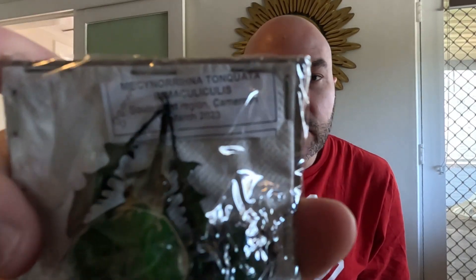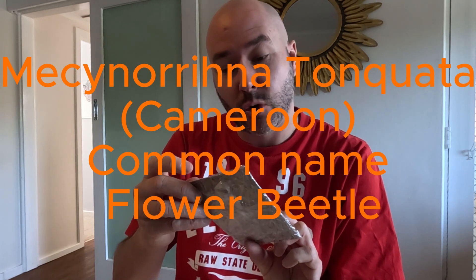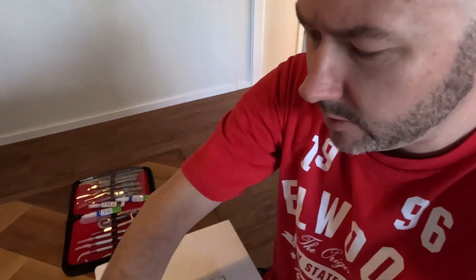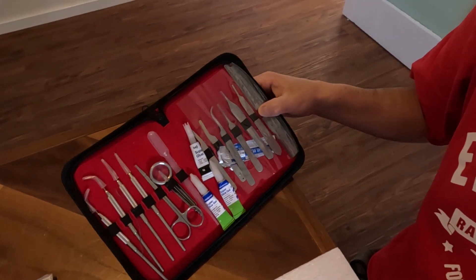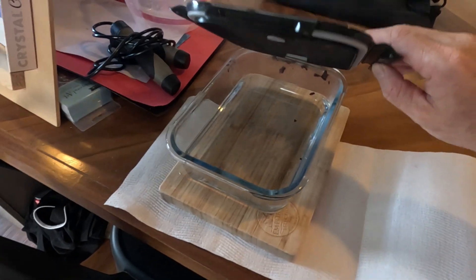Today we're pinning some beetles — that's what we're doing today, a bit of a how-I-do-it instructional video. We've got the Maya Chinorina Tonquata from Cameroon, quite a big bug. Here are some of the tools of the trade: lots of pins, styrofoam to pin it to, and a little toolkit with lots of different scalpels and tweezers. We've also got a container of boiling water that's going to rehydrate the insect.